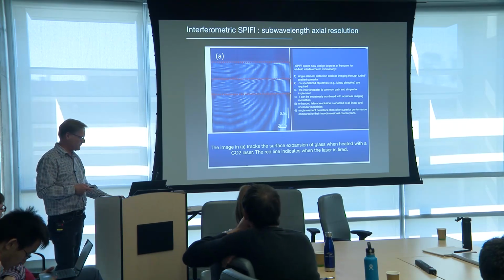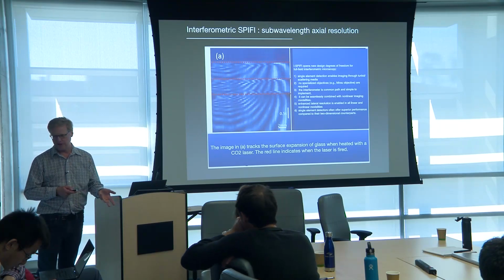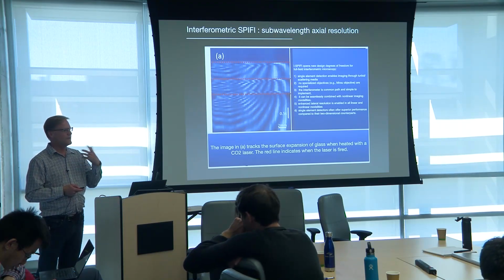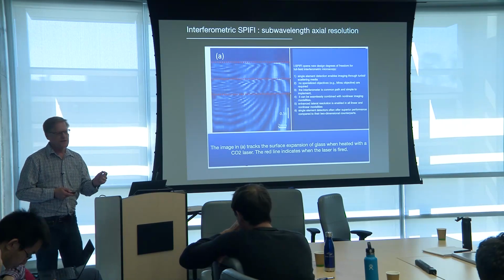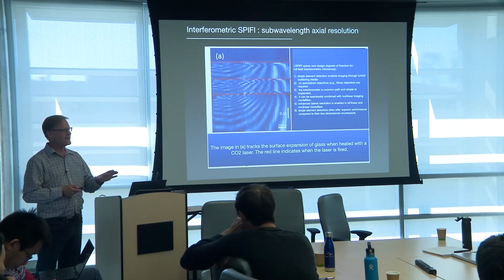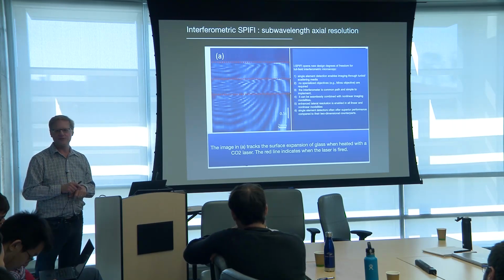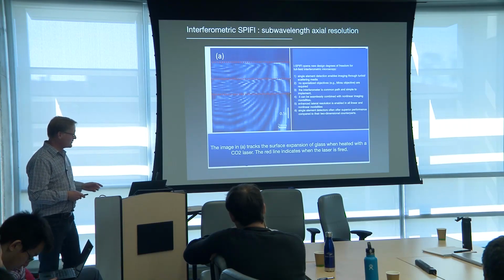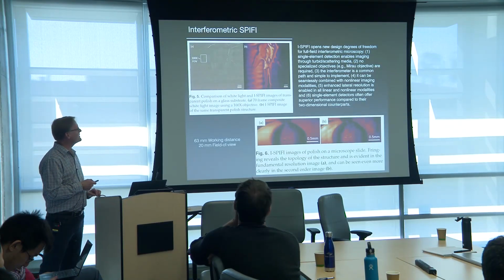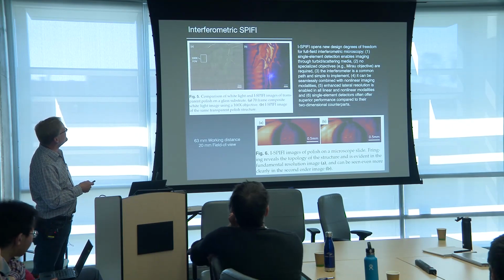And then I had to try to come up with other phase objects. I had some clear lacquer in the lab that had been sitting on a shelf for about 10 years. I took a drop of that clear lacquer and put it on a slide, and it had kind of separated from its different constituents, whatever the lacquer is made up of. I tried to image that, and this is the image I got of the lacquer as it dried.